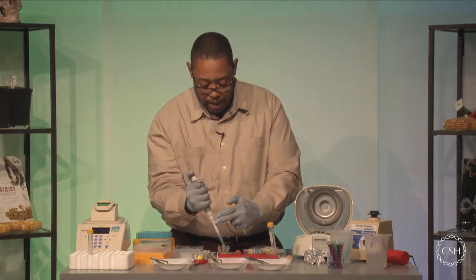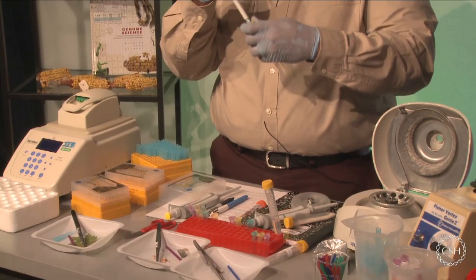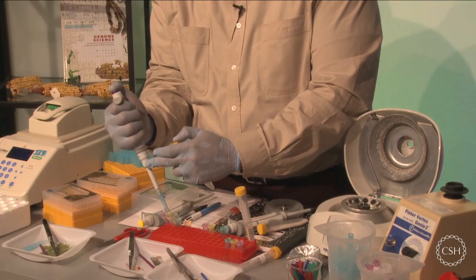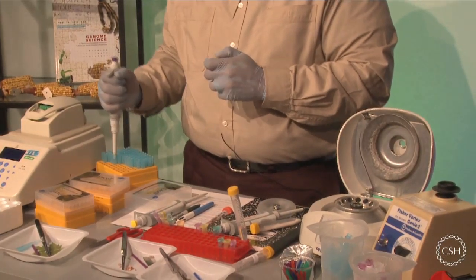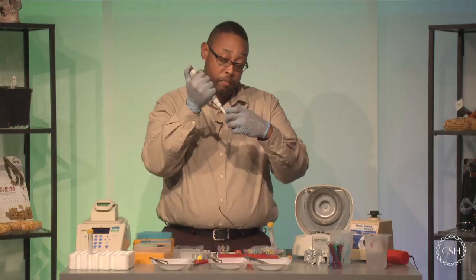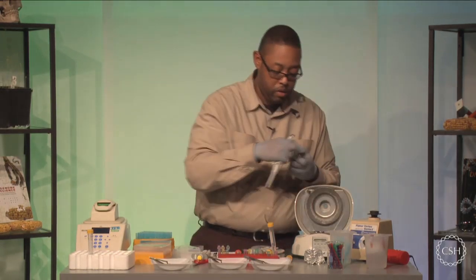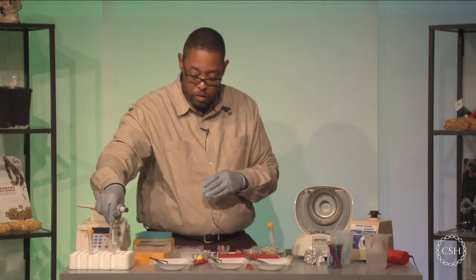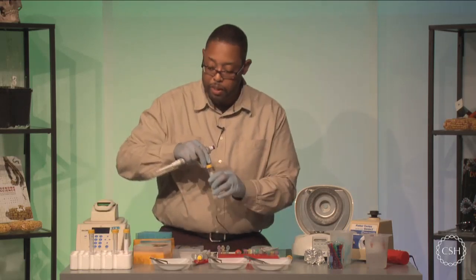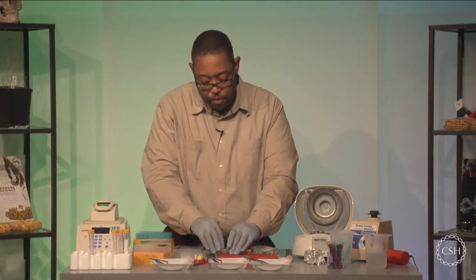Okay, so make sure you're adding your wash buffer to each test tube sterilely still. And I'm basically done with my silica resin and my wash buffer. And I'm also done with my lysis solution, so I'm just going to push those off to the side. So I've added the wash buffer, the second round.